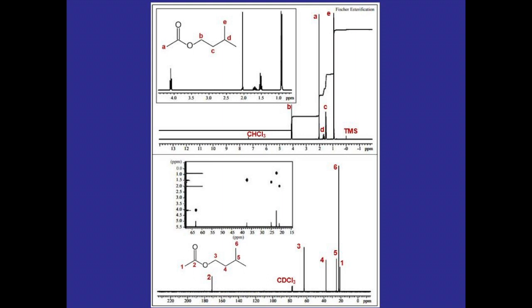You should have the molecules drawn out and all of the hydrogens and their corresponding peaks labeled with letters, and all of the carbons and their corresponding peaks labeled with numbers. And you'll also want to have all of the correct solvents labeled on there as well. You'll do this with all of the NMRs pertaining to each lab and turn them in with their respective lab write-ups.